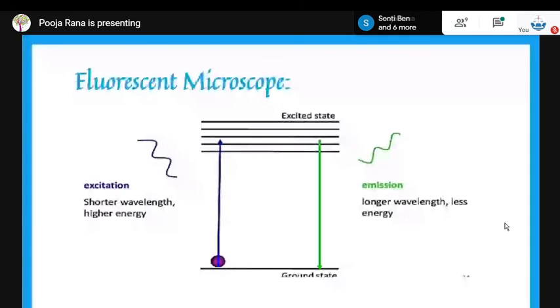All right. Now, when certain compounds are illuminated with high energy light, they emit light of a different or lower frequency. This particular effect is known as fluorescence. Often specimens show their own characteristic autofluorescence image, based on their chemical makeup. Specimens which are usually stained with fluorochromes usually give this type of energy.